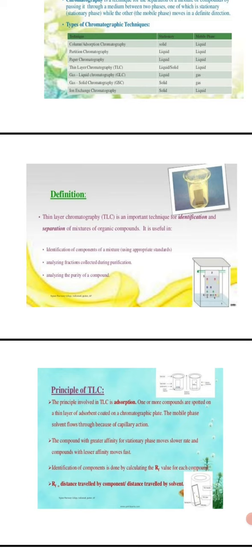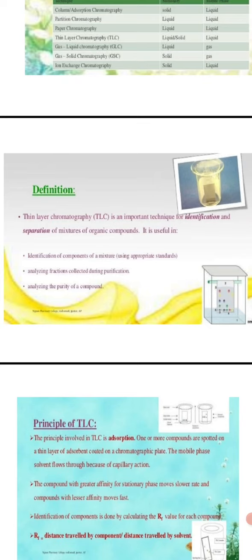So it is useful in different aspects like identification of the components of a mixture using appropriate standards. Then second one is analyzing fractions which are collected during the purification process, and third one is analyzing the purity of the compounds. So these are the main key applications of TLC or the chromatographic techniques.